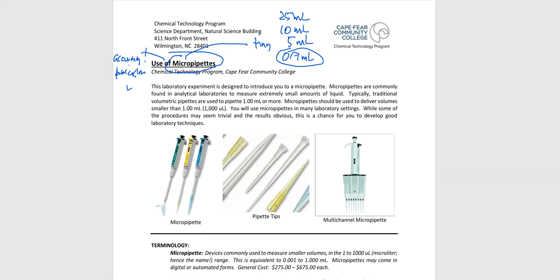So that's what this lab experiment is all about. So very tiny volumes here, and the tiny volumes is microliter. We abbreviate that with what looks like a U, even though it's not a U. That U has a really long stem on the left-hand side. That is called the Greek letter mu. So, yeah, that's my cat noise. Either way, that microliter is going to be pretty important because that means super small quantities here.